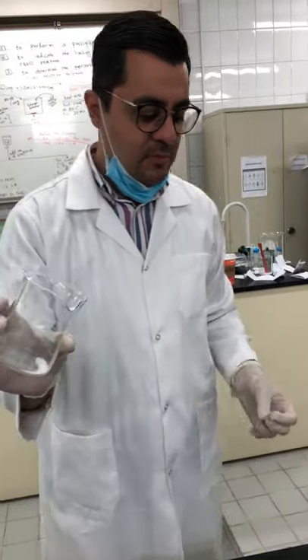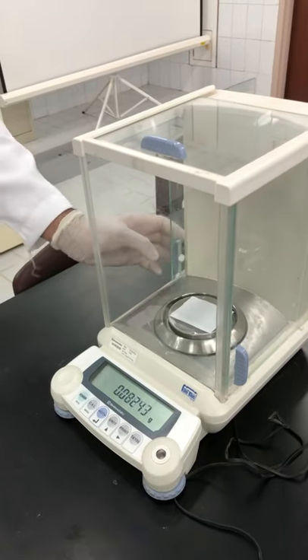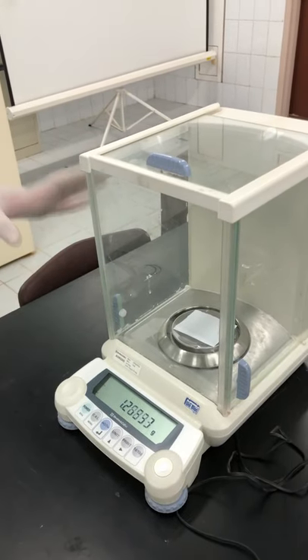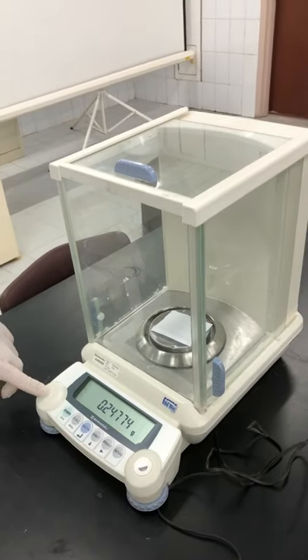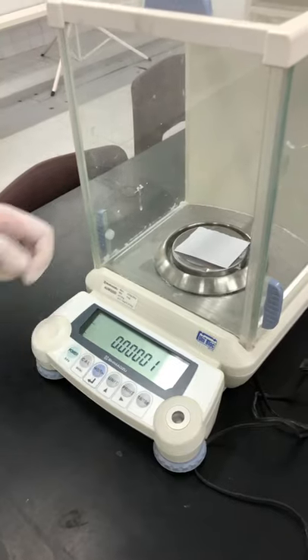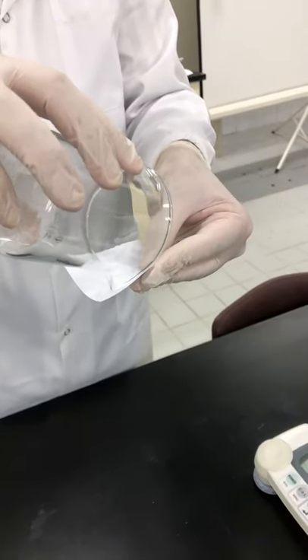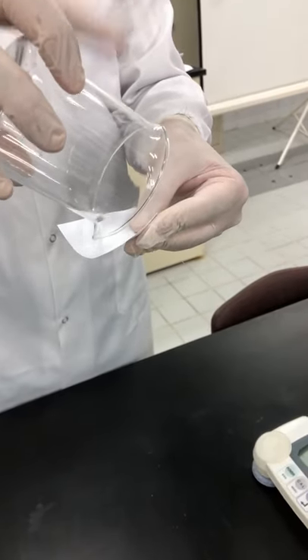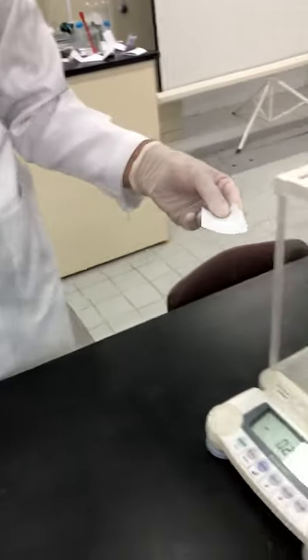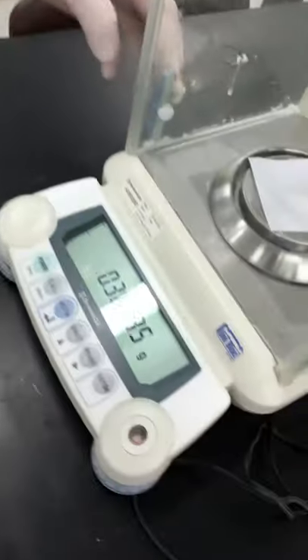Now I'll weigh about 20 grams of this mixture. Once I do this step, please record the reading of the balance. I take it out — here is about 20 grams, more or less. Take the reading of the balance as it is; don't round it, because this mass is important for the calculation part.